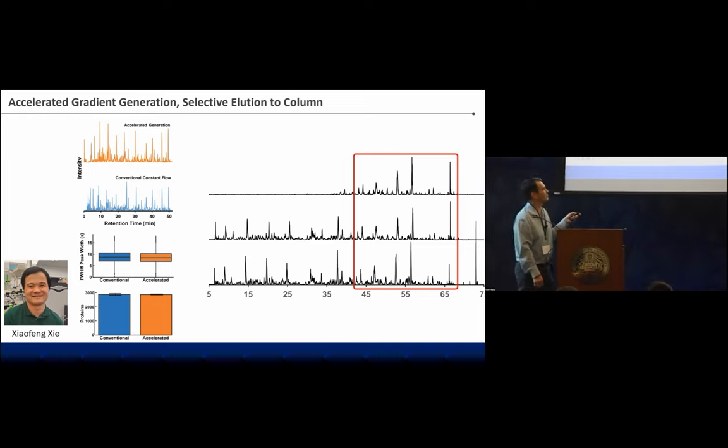Yeah, so for this work, this has just been fritted on both ends. So we can do backflush packed SPE columns. Kay Weber in my group has an oral, I think, on Thursday afternoon at ASMS on an open tubular SPE column that he's working on. That originated because we were very frustrated with clogging our trap columns all the time. Now, as we've learned some of those tricks, that's not happening very much anymore. The open tubular columns don't have quite the same performance yet. It's a work in progress.